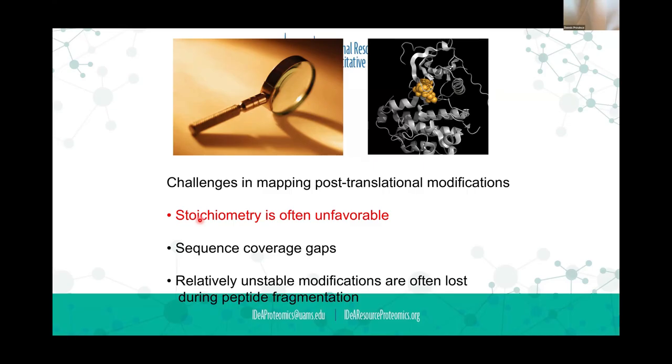We talked a little yesterday about the peptides that we see. Mike gave a good overview of the best flyers. The best flyer peptides are never phosphorylated. I wish they were, but they never are. And so there are always regions of the protein that are difficult to cover.